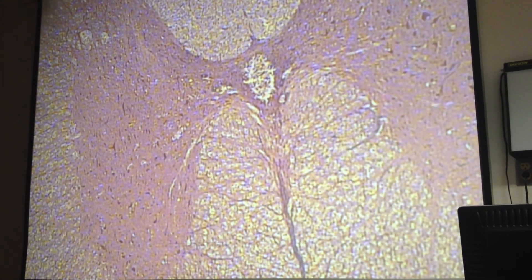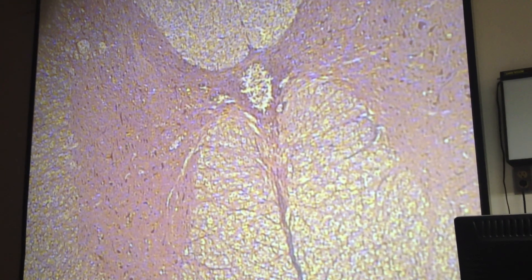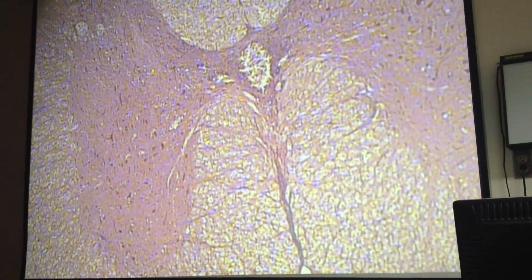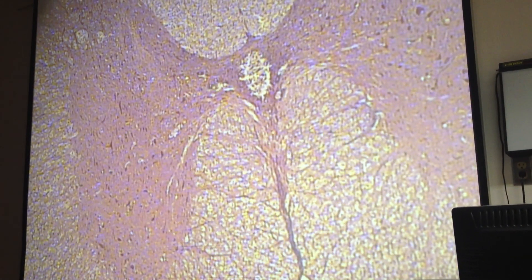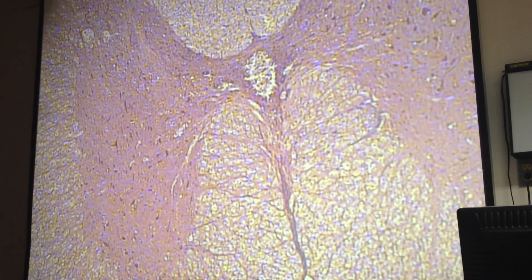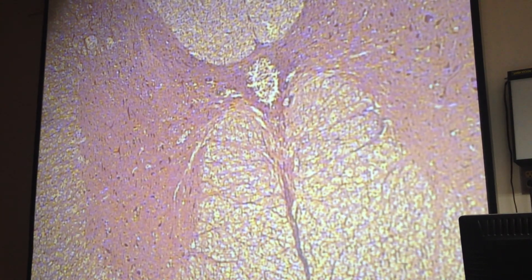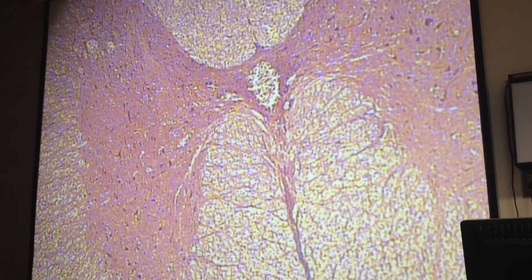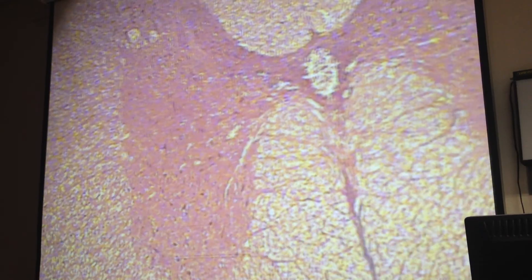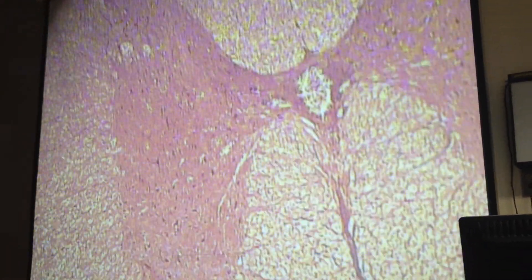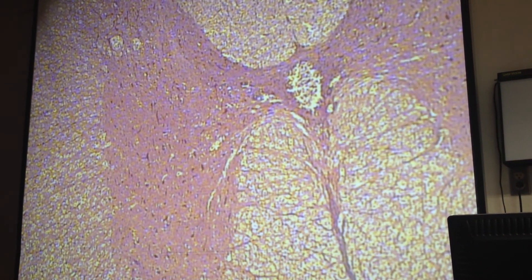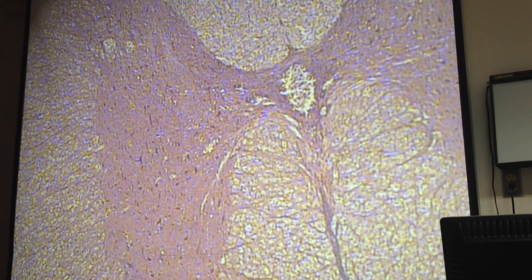All right, so this is a higher magnification than what this microscope has. That would have been the advantage of the dissecting scope if I had gotten it out, but I didn't. The dissecting scope, you can see a little bit farther away and you see more of the image all at once. So what is this organ that we're looking at here? Spinal cord. Yeah, it's a spinal cord.